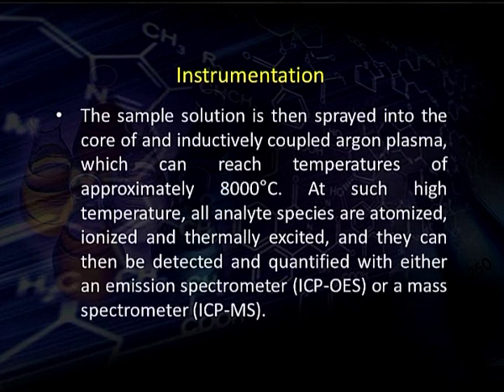The sample solution is then sprayed into the core of the inductively coupled argon plasma, which can reach temperatures of approximately 8000 degrees Celsius. At such high temperature, all analyte species are atomized. That means they are converted into atoms.